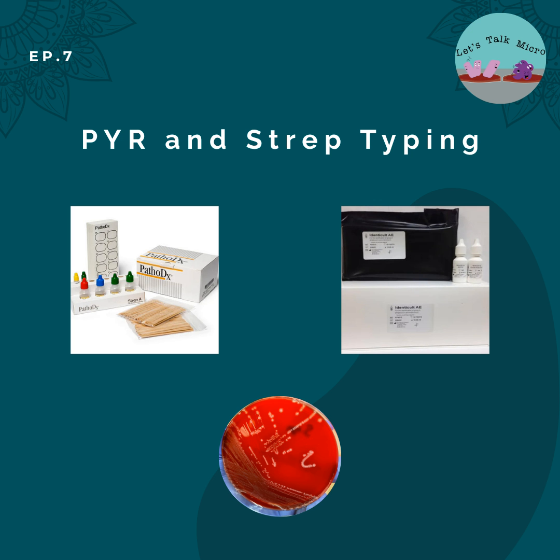Faecalis, Faecium, Durans, and all those other ones. As far as hemolysis, you know that Streptococcus pyogenes is beta hemolytic, and Enterococcus can actually exhibit all three hemolysis types. The most common ones are gamma, which is for your Faecalis, and alpha for your Faecium and avium. But you can have beta hemolytic Enterococcus. And I will talk a little bit more about Enterococcus once I get through the strep typing.